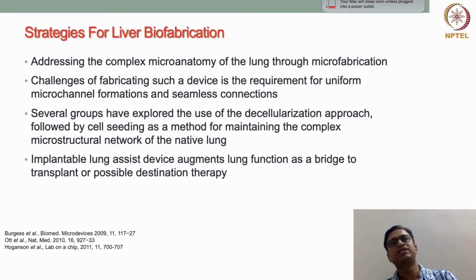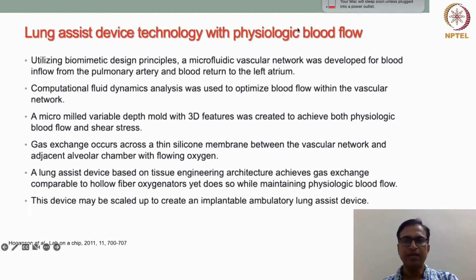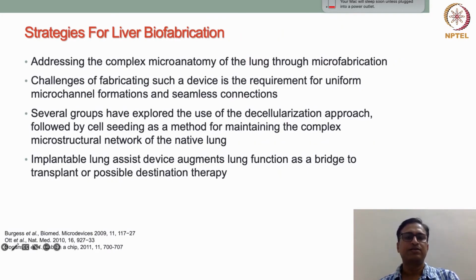Through that, the detergent solution is pumped, and the detergent can remove the cells. That process is called decellularization. By this way, the cells can be removed from the whole lung tissue.